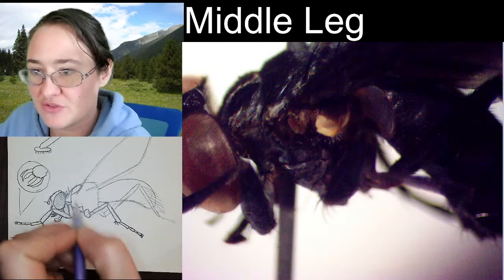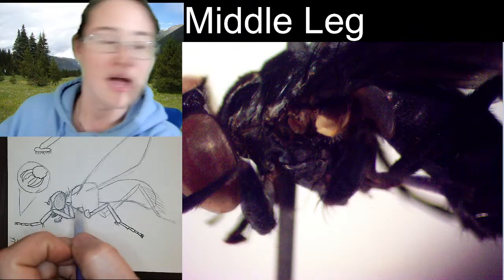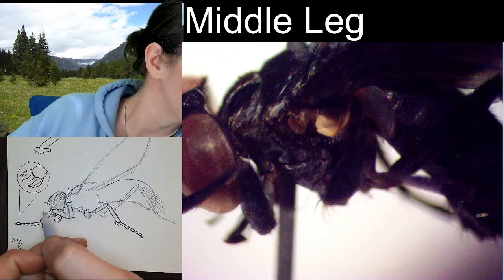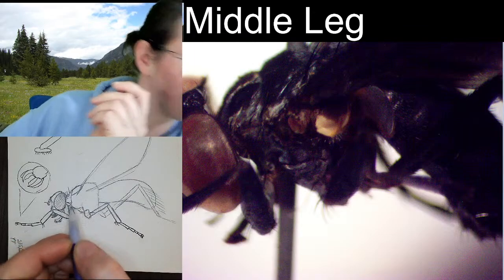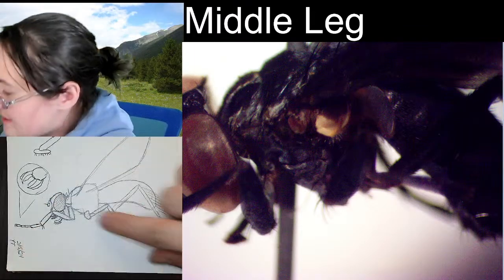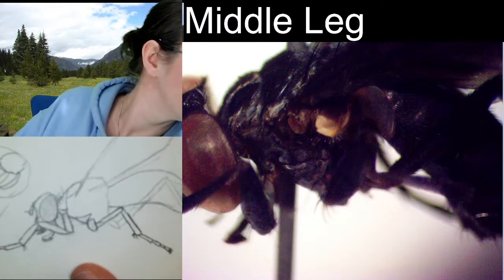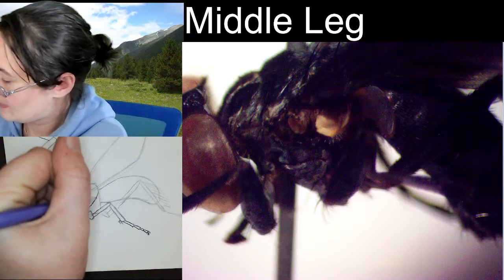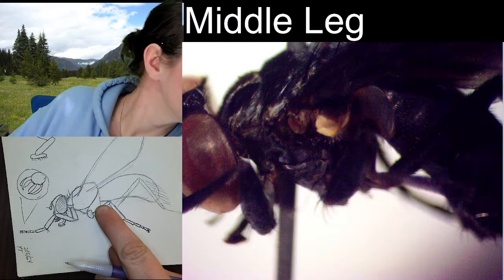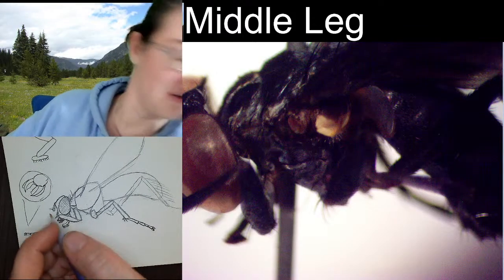For the rest of this region in the thorax, I'm only seeing kind of 2 more sclerites because you've got the middle one and the hind one. And I was trying to come up with where these are divided. But what it looks like is you've got this triangle down here on the bottom that is actually, instead of coming straight up, kind of wider here up on the top. And then this, playing around with these sclerites.